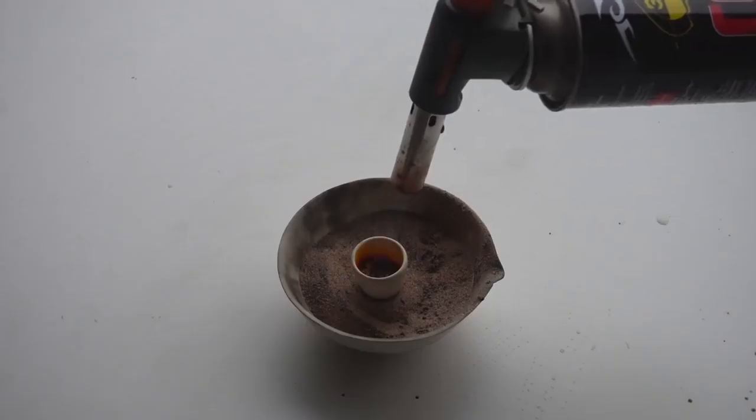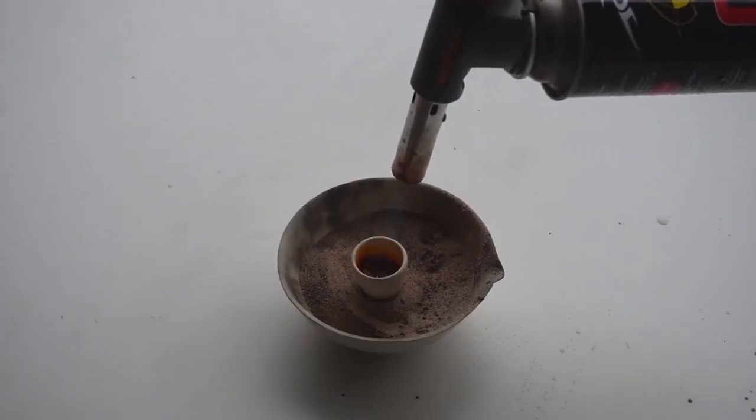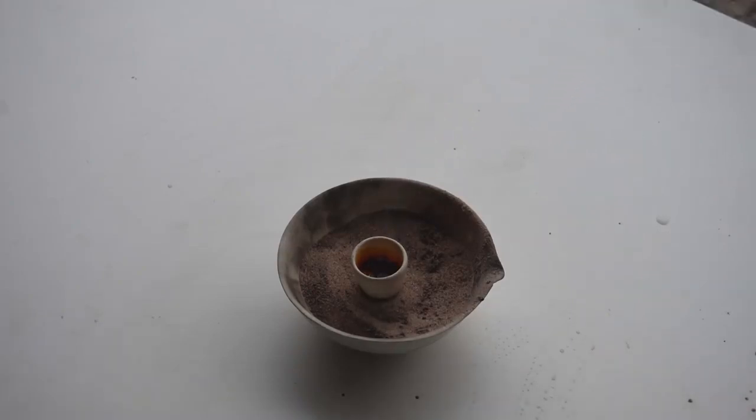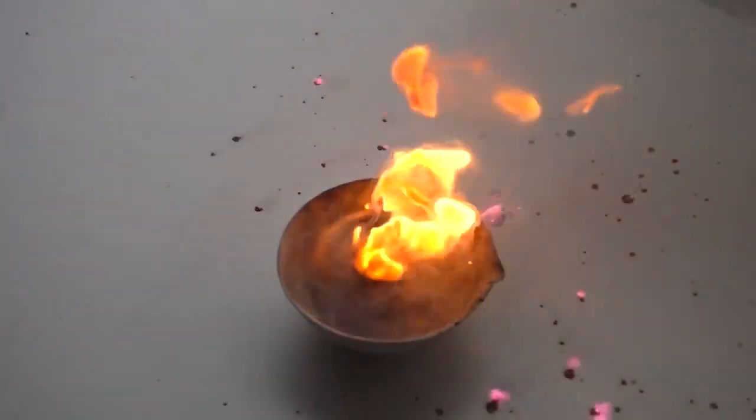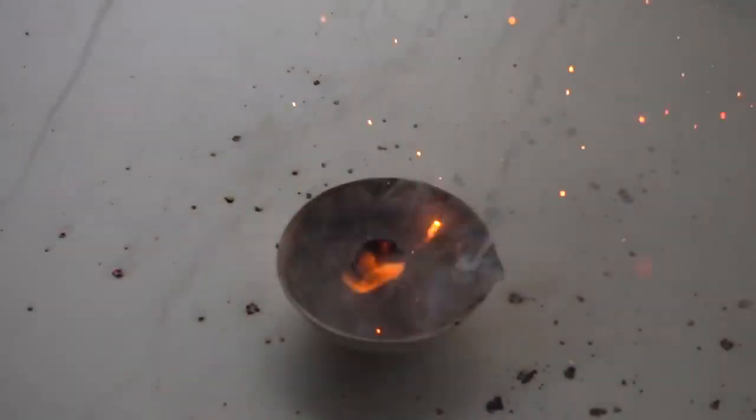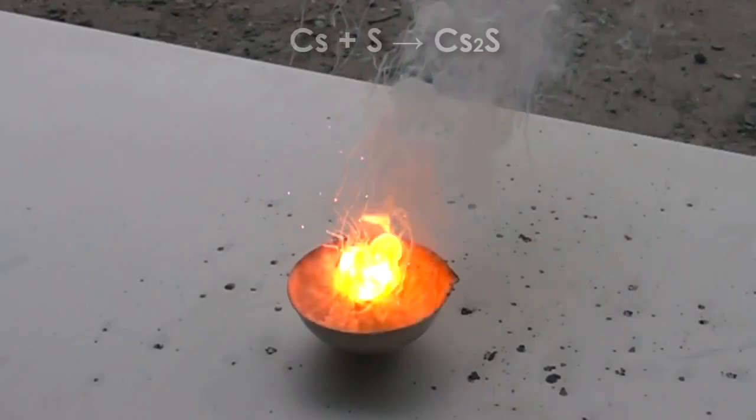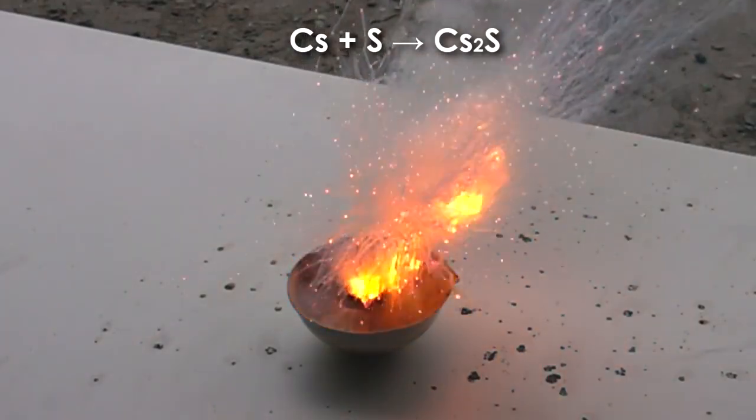The coolest reaction by far was cesium with sulfur, when we threw the pieces of cesium in molten sulfur. In that reaction, the two elements formed cesium sulfide.